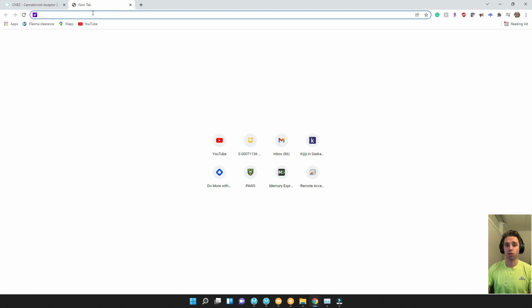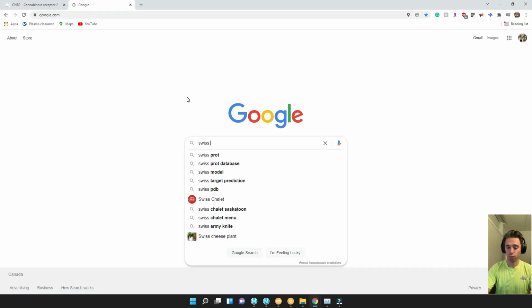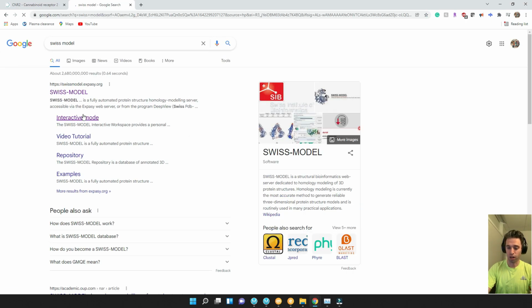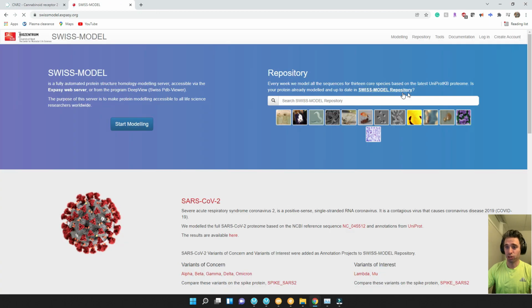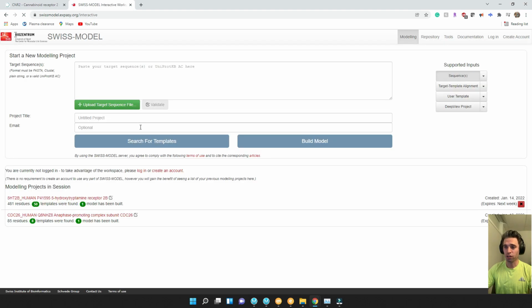We then need to go to another website to punch this information in. We can just Google Swiss Model. This is the web service that we're going to use, Swiss Model right on top. What we're going to do is go to modeling, and then start modeling.